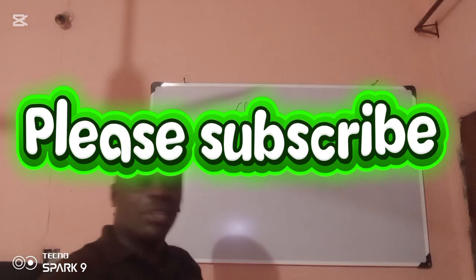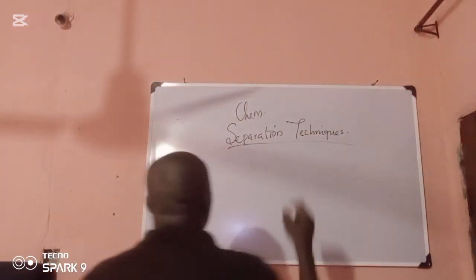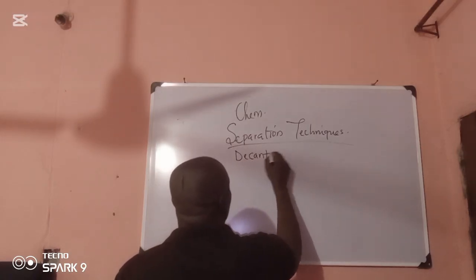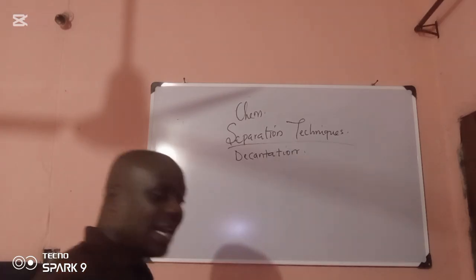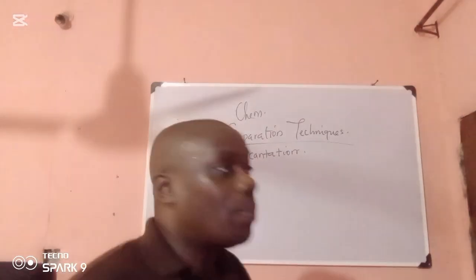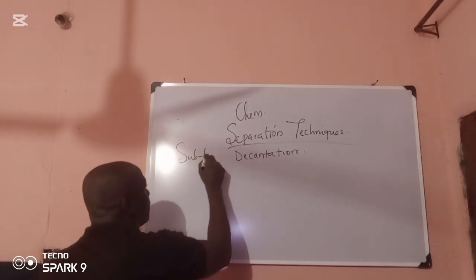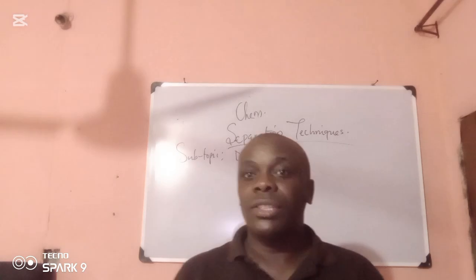Under these separation techniques that we are looking at today, we are going to look at a subtopic. The subtopic is decantation.